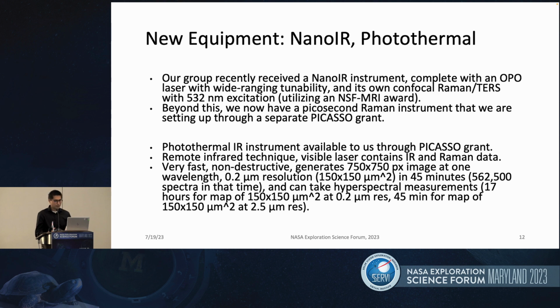This instrument is planned to take very rapid, detailed images of 750 by 750 pixel images with up to a fifth of a micron in resolution in only 45 minutes, procuring up to 500,000 spectra at a time.